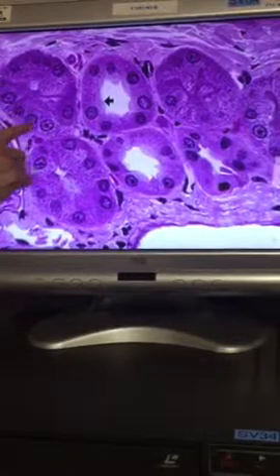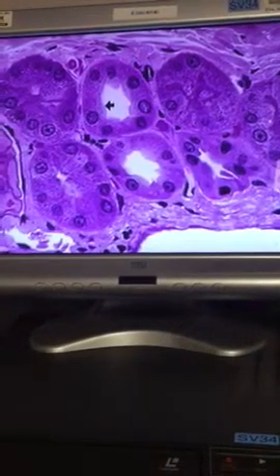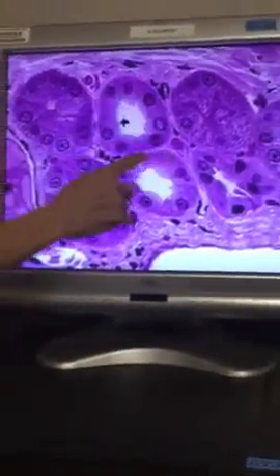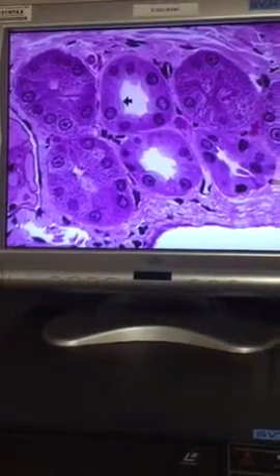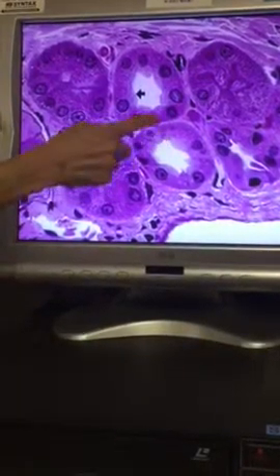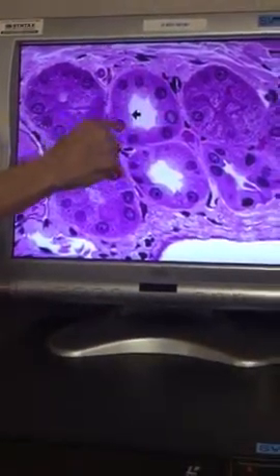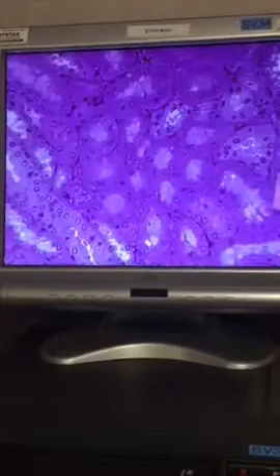This looks a little different. These cells happen to be a little fatter, so the lumen is very, very small. I think this is a little bit more clear. And sometimes when people first start looking at tissue slides, it's confusing because notice how close these tubules are to each other, so it kind of looks like, almost like this is stratified. But I think the more you look at these, you'll start to recognize that these are two individual tubules that are both lined with simple cuboidal.